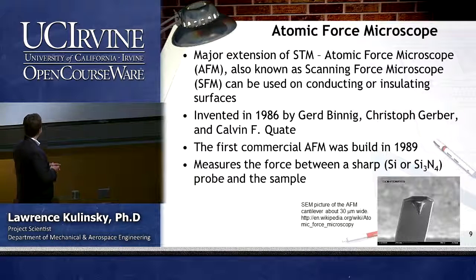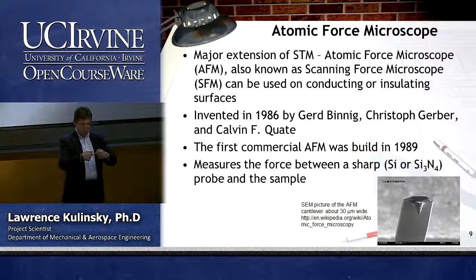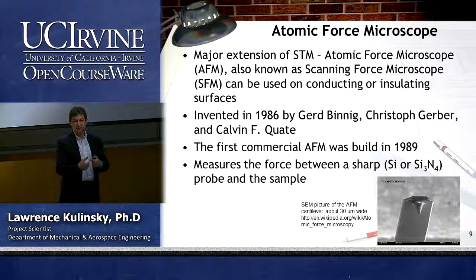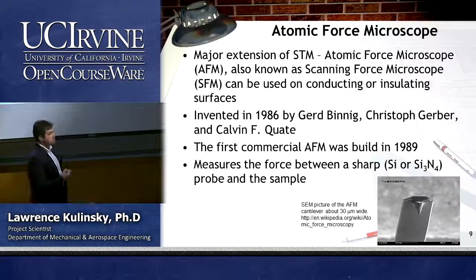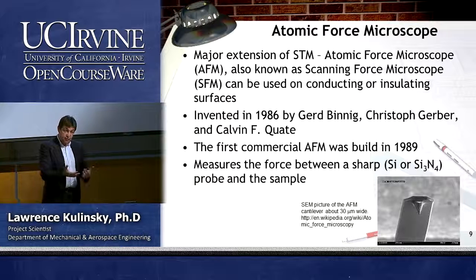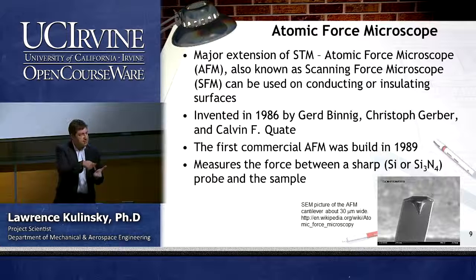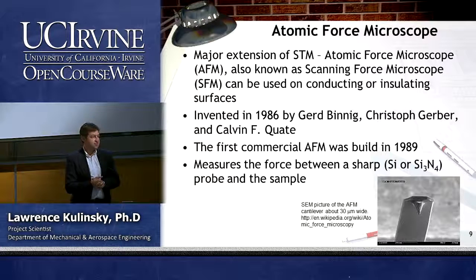So it basically measures force between a very sharp tip, typically silicon or silicon nitride, and the surface. Well, if it measures forces, what kind of forces? What kind of forces do we have between the surface and the tip? I don't have it on this slide. Great. So what kind of surface forces do you know?